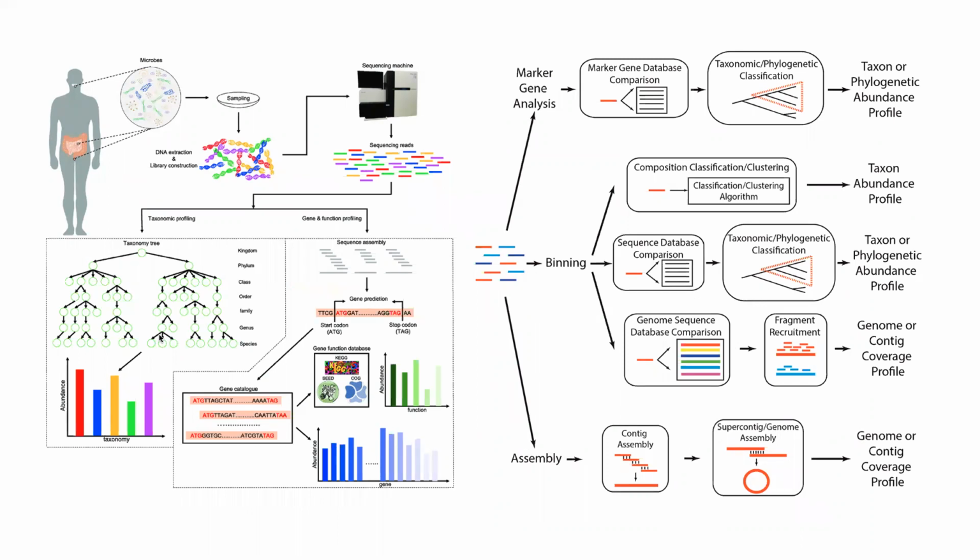Or we can try to understand specific members of that community and try to infer the functionality. So we sometimes want to understand what specific functions these genes have, what is the function of those sequences. So when we talk about 16S ribosomal RNA gene sequencing, it really gives us the ability to describe complex microbial communities without necessarily knowing all of the individual members of that community.